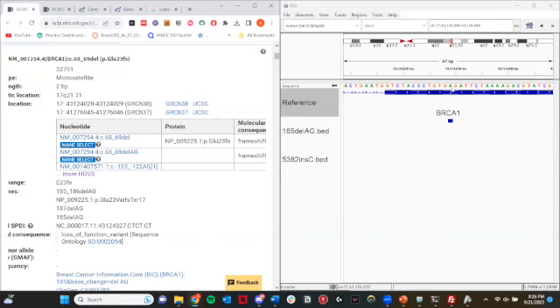Okay. So reading those two AGs, from the 3' to 5', just because it's on the reverse frame. I guess my question was, it says 68, 69, but it's also 185, 186. Is that because it could be different splice variants? I didn't understand the 185 part, because I thought it was the 185th position.